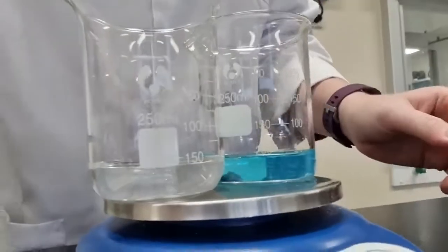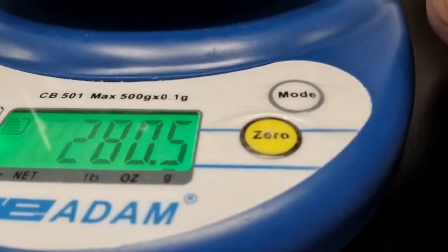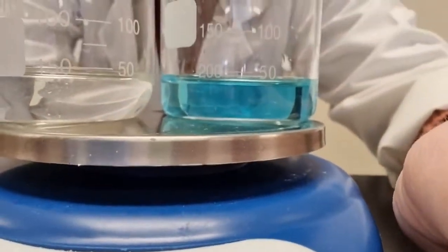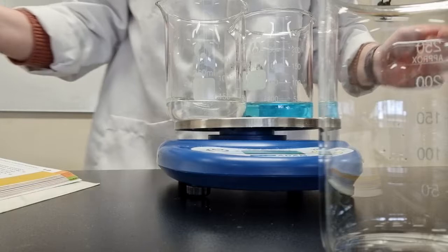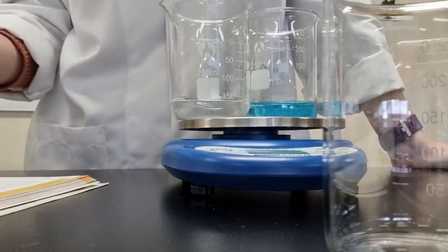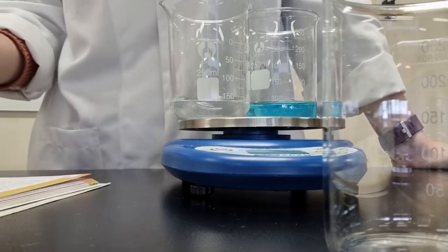So I've tared my electronic balance. You can see they're both on here. It's in grams. We've got 280.5 grams with these 2 beakers. So what I'm going to do now, you need to write down that number in the first row where it's total mass before mixing in grams for sodium hydroxide and copper sulfate.